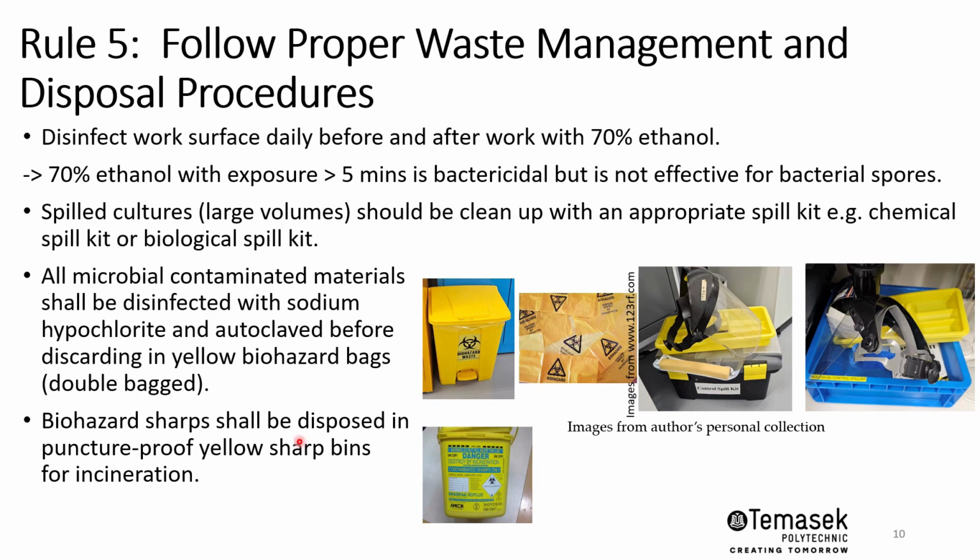If you have any sharps that you'll be using, maybe inoculation needles or tips, these need to be disposed of properly, especially the sharps that contain blades. They should be disposed of in puncture-proof yellow sharp bins for incineration, as shown in the photo here. These are sharp bins that contain biohazard materials.